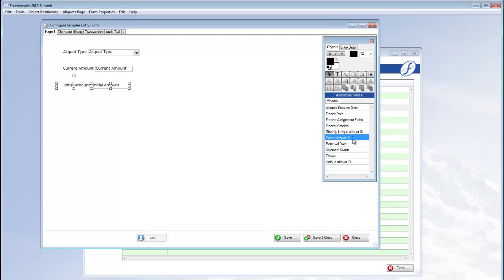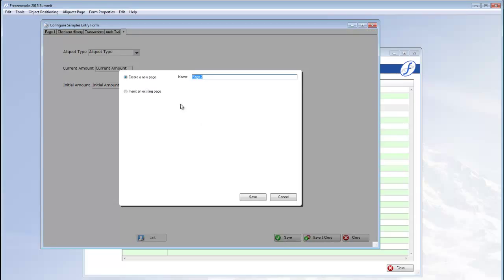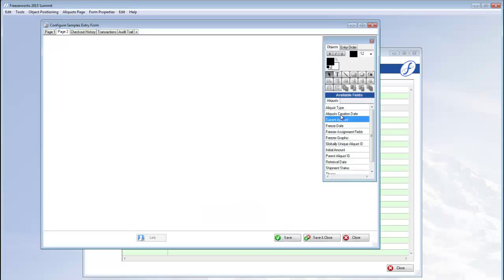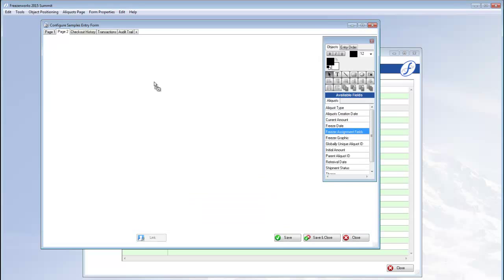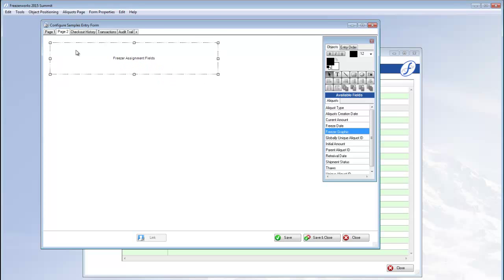The freezer assignment fields and the freezer graphic will give you the ability to assign freezer positions to aliquots during data entry. So make sure to have them on at least one aliquots page.